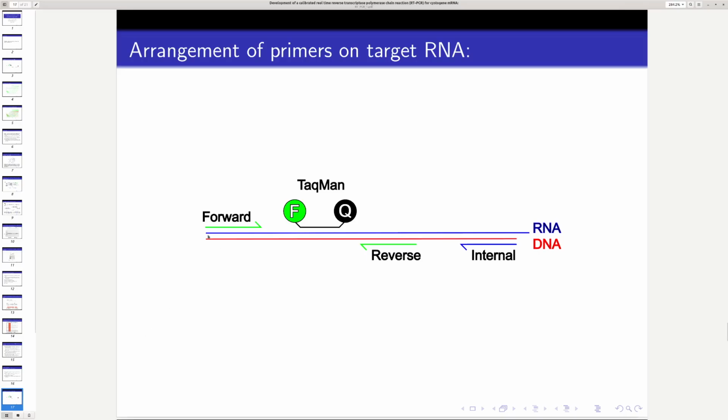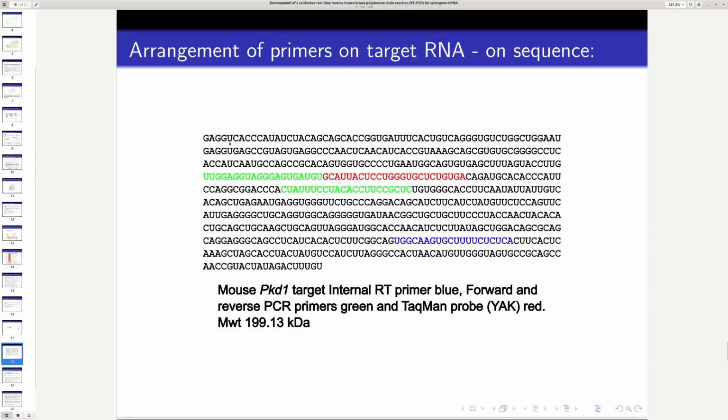And this is just to remind you of what we're doing. We've got 4 of these RNAs in there, okay? And then we're going to do a reverse transcriptase reaction with this internal primer, okay? So that's the next step. And this is the actual RNA sequence that we've got, and so this is that internal primer again. You see there are no T's, it's all U's because it's RNA. Okay, and so this internal primer will copy this RNA and make it into antisense DNA, and then cover this area as well, all right?